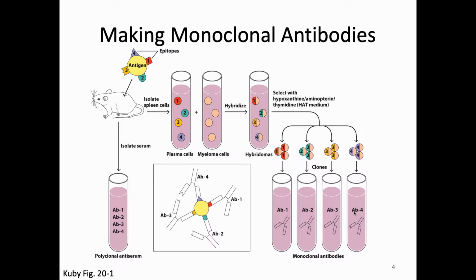And we can grow that hybridoma in special media that kills any unfused cells. And so in the end, the only cells that live are the fused cells, because the unfused cells are going to live for a short time anyway, so you don't really care. These get killed by this media, and the fused cells are the only cells that can live in your special media. And now you've got the benefit of a cell that makes your antibody against your epitope of interest. It has done the VDJ that you want, but it has also gained immortality from being fused with an immortal cell line. So you can then sort out those fused cells and now grow your hybridoma forever and ever and ever and get all the antibodies you want and get all the monoclonals that you want.